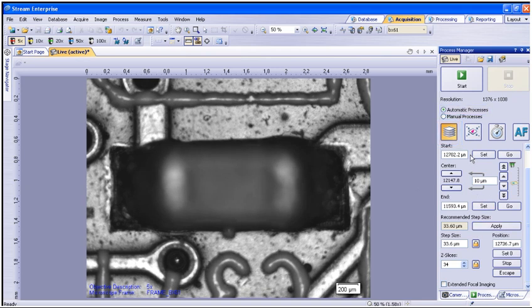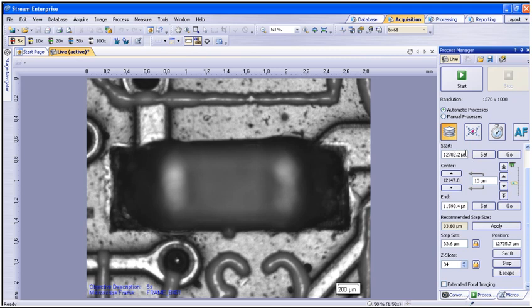To start, make sure to set focus at the bottom of your sample, either by using the hardware focus knob or the focus buttons within the software. Starting at the bottom of focus ensures the image will not be inverted. Once this bottom focus point has been reached, you will want to select the start set point.